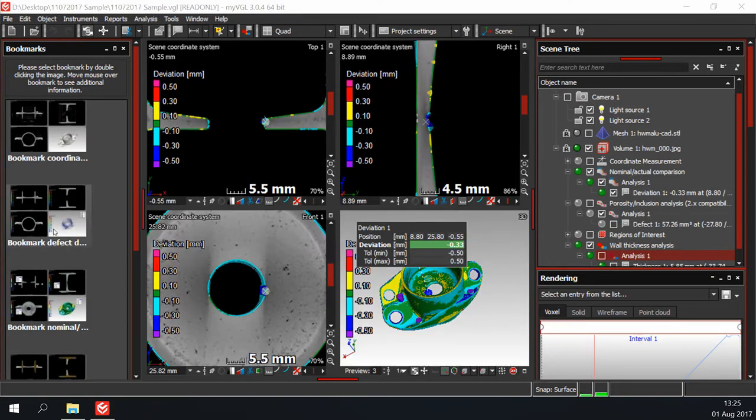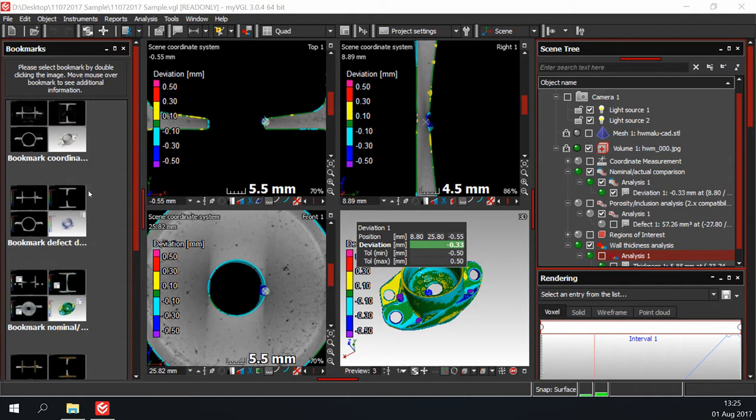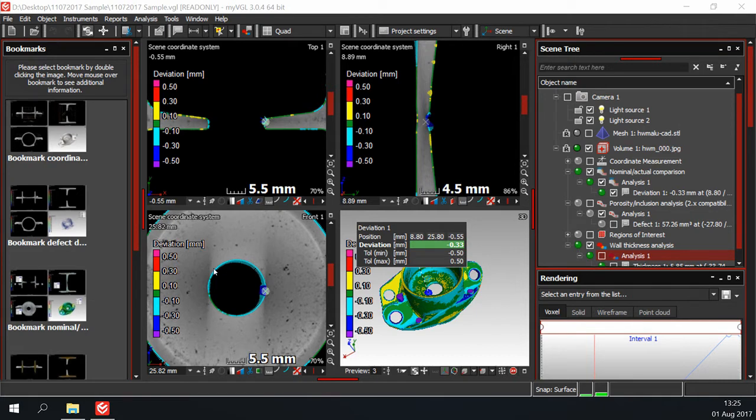At first glance you'll see the following layout. On the left there is a bookmarks bar. In the center there are four windows. Three of them are 2D views through the X, Y, and Z axis.